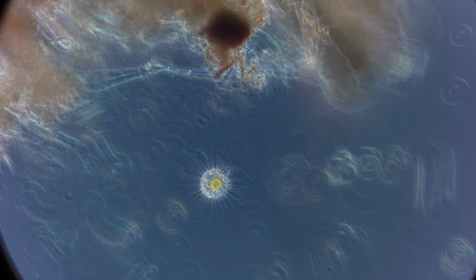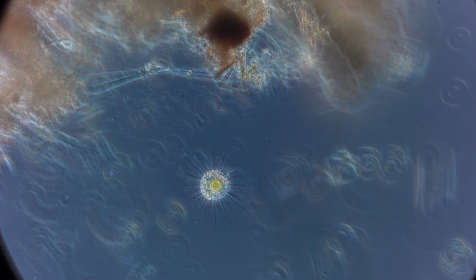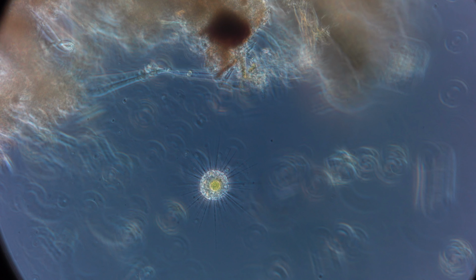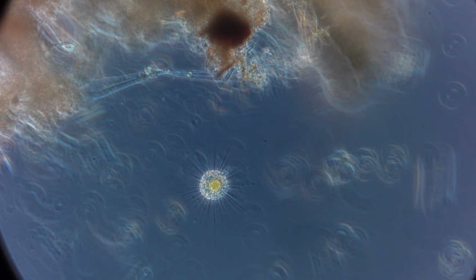He looks like he has some endosymbiotic algae, so a lot of the ciliates and stuff that Cricket studies can eat algae and then photosynthesize. Like if you could eat plants and get energy from the sun. They're an animal, but they eat a plant and then use that chemistry and get energy from it. And it's like, I want to be able to do that, man.